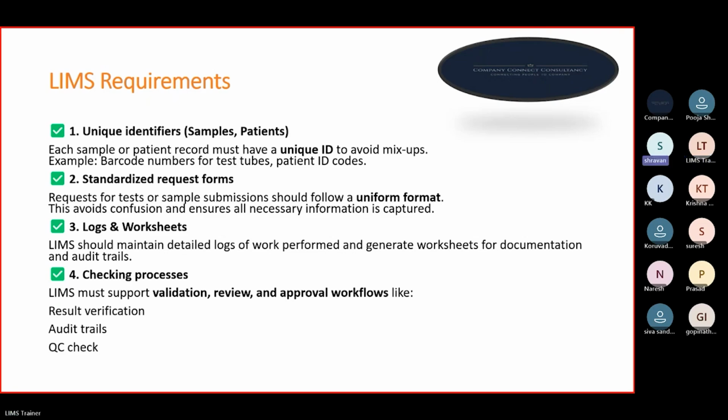Sir, regarding the departments in LIMS, is it product-based and support-oriented, so mainly implementation is one department and secondary is support? Two departments are there in the IT industry. Your voice is very low, I cannot hear you at least.